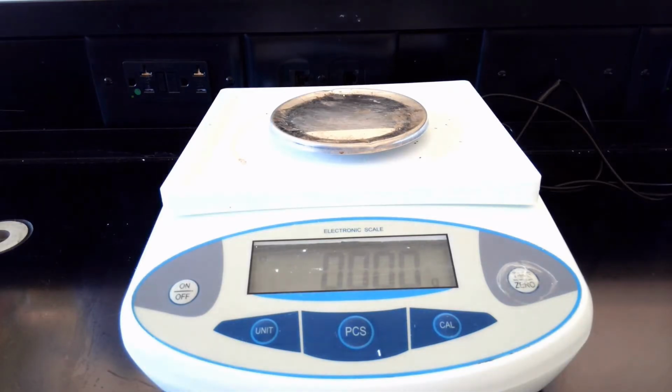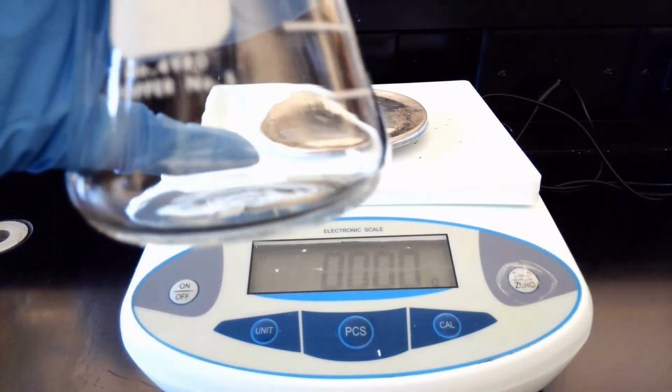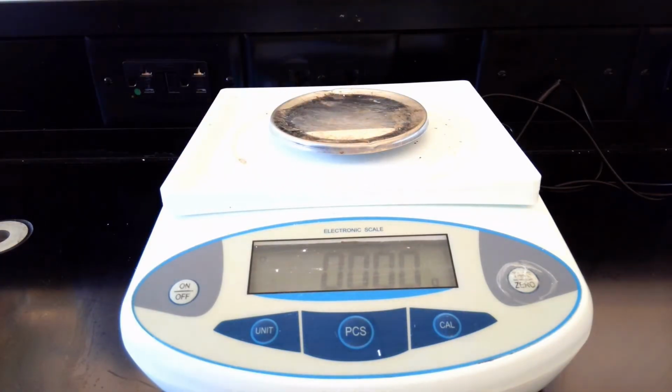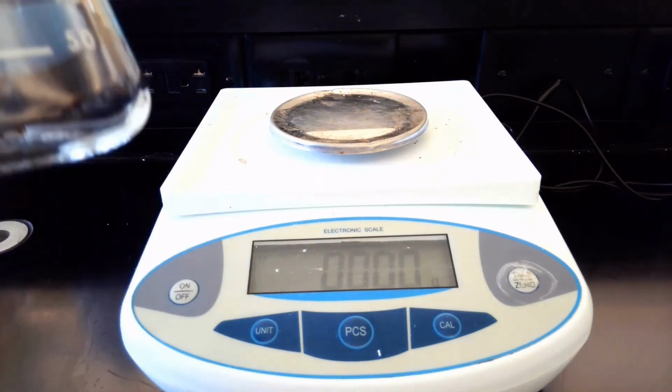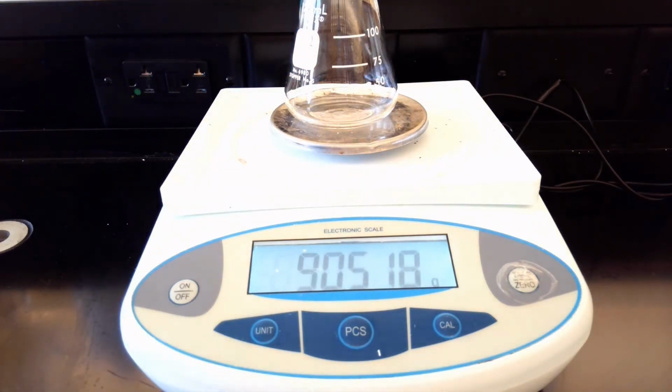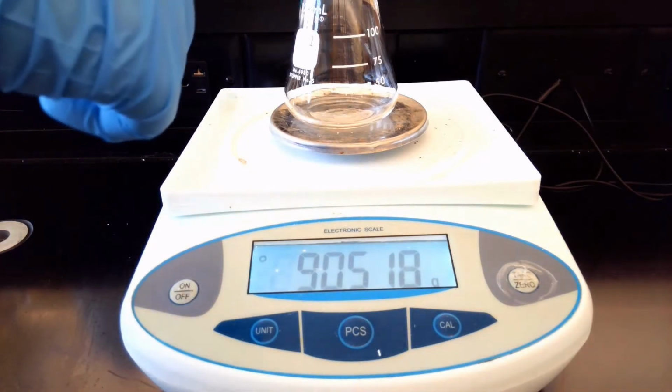Our flask has cooled to room temperature. As you can see, a little bit of the vapor condensed on the bottom, but that's okay. We fully wiped down our flask to make sure it's dry. And we're going to just remass it. So here is our new mass. This is with the vapor. This would be 90.518 grams.